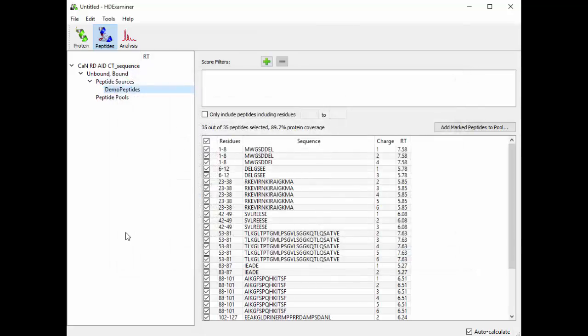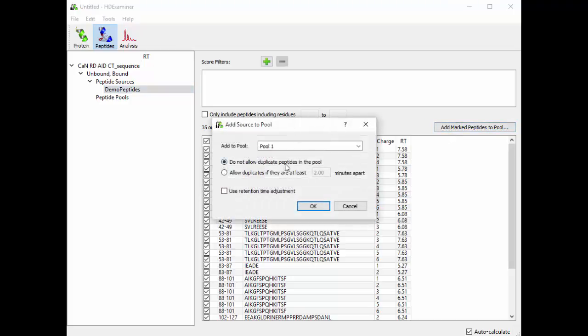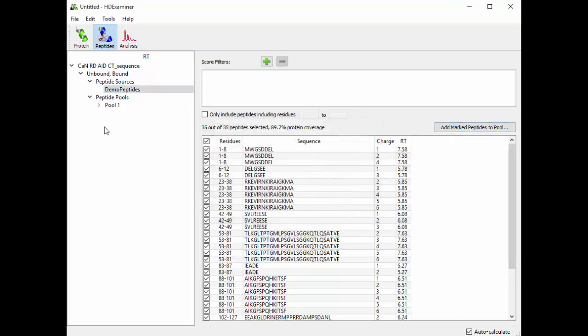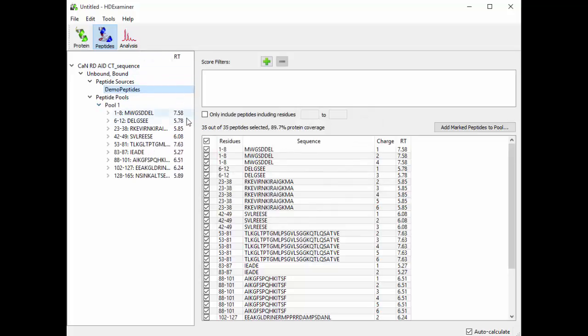Once you have a peptide source, it's time to turn it into a peptide pool. Now there are many features that HDExaminer can do to help you filter your peptide source before turning it into a peptide pool, but I'm not covering those in this video. So to turn a peptide source into a peptide pool, we click this Add Marked Peptides to Pool button, and we add them to pool 1. So now we have a list of peptides in our pool, and the retention times at which we expect to find each of these peptides.